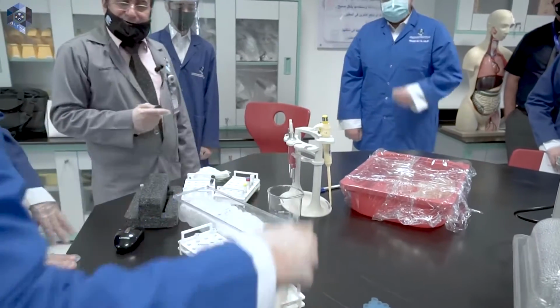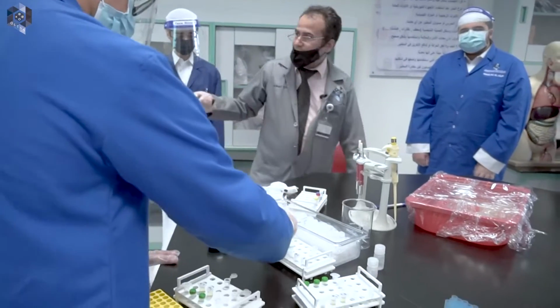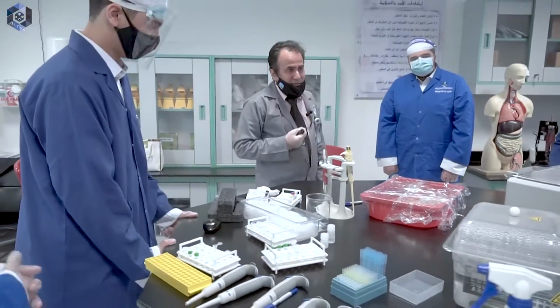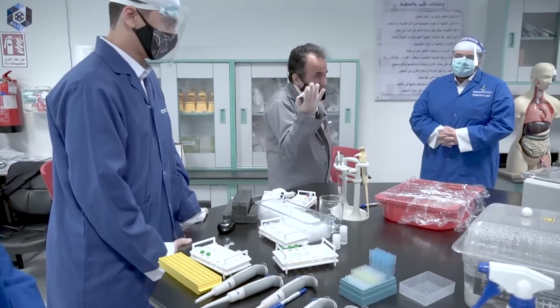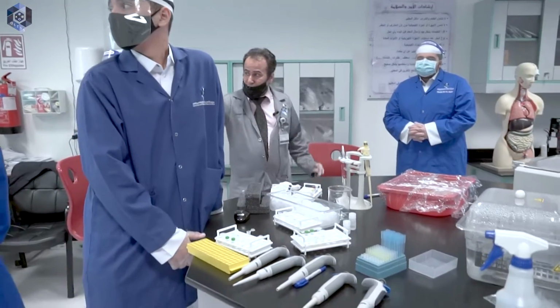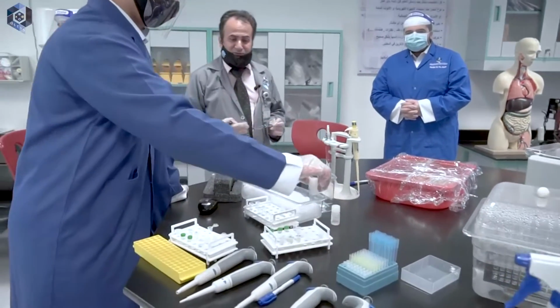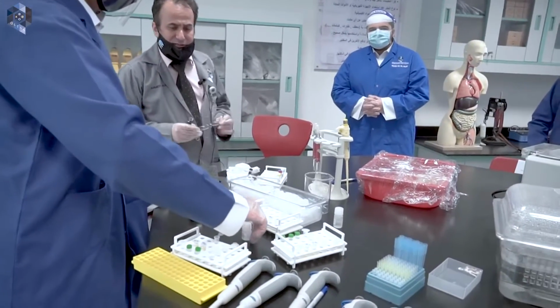Now, the next thing, we are going to dilute these 5 microliters with 45 microliters of ultra pure water. Note, I want you to learn how to read the procedure, how to follow the procedure. You need not memorize the procedure. You just read it through and follow it up. I know this is a long procedure, but you have to be a little more organized. Now, I want another student to take 45 microliters of distilled water and add to the DLR tubes.